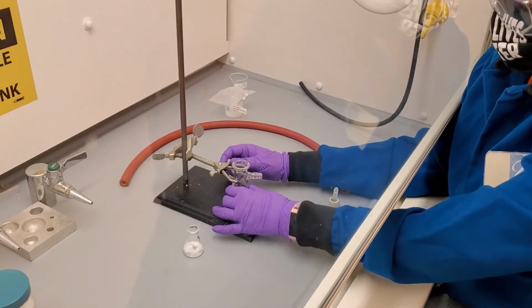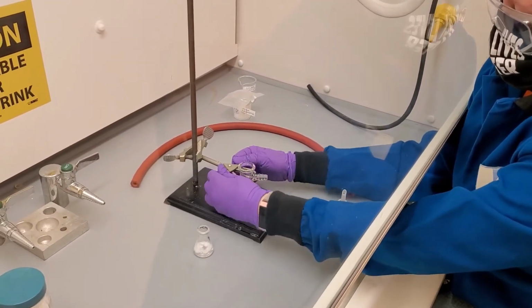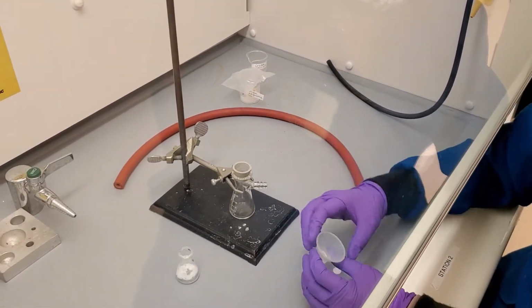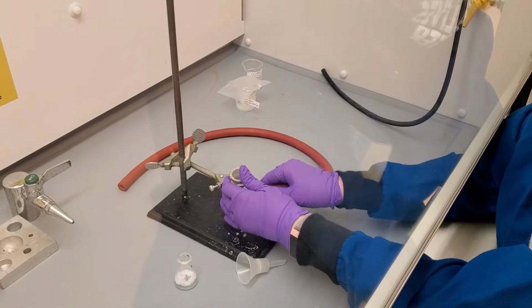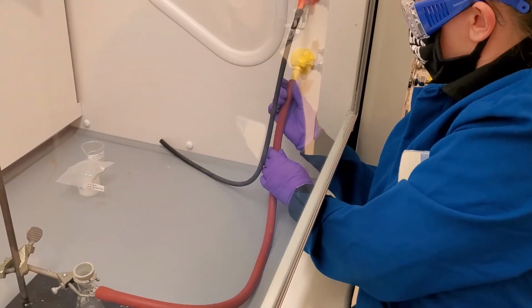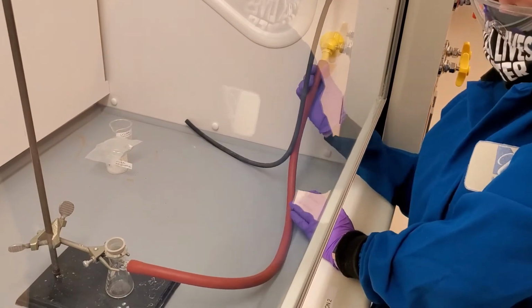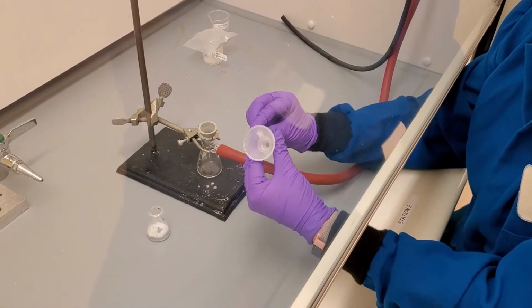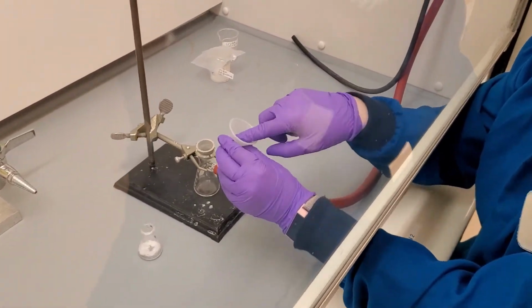We need to prepare the vacuum filtration setup so that we can vacuum filter our product. As in previous experiments, we clamp our filter flask to the ring stand, add the neoprene adapter for a tight seal, attach the hose to the vacuum nozzle, place a new filter in the Hirsch funnel, and place the Hirsch funnel in the neoprene adapter.